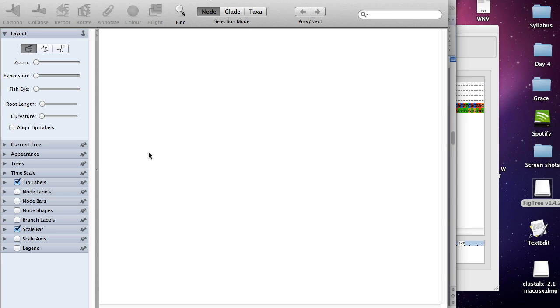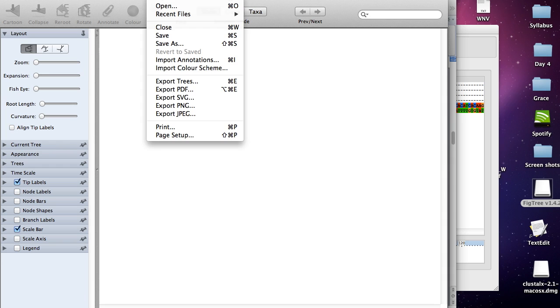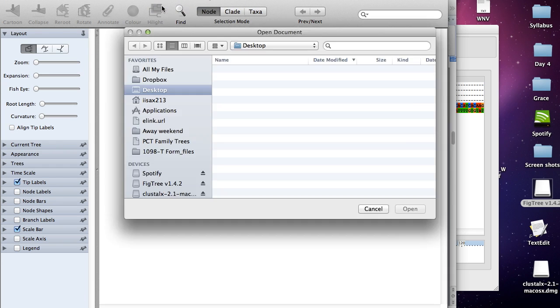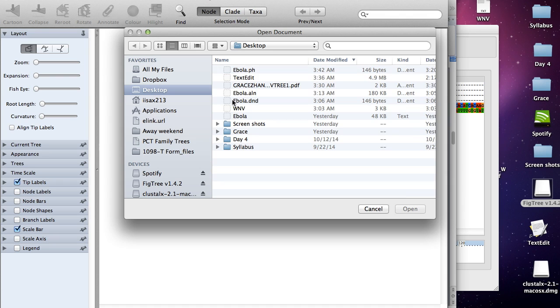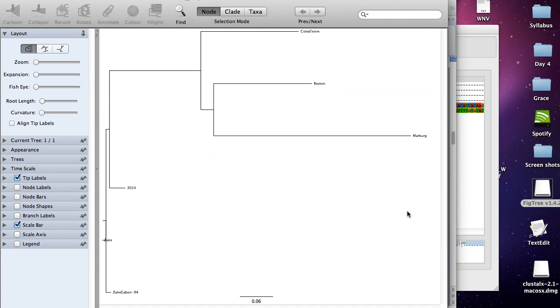When you open the FigTree program, you'll see a number of options. Make sure this rectangle tree is chosen. Now you can click on file, open, and then you're just going to open the .ph file and it's going to load your tree. So now you're looking at a tree showing the relationships of all the sequences.